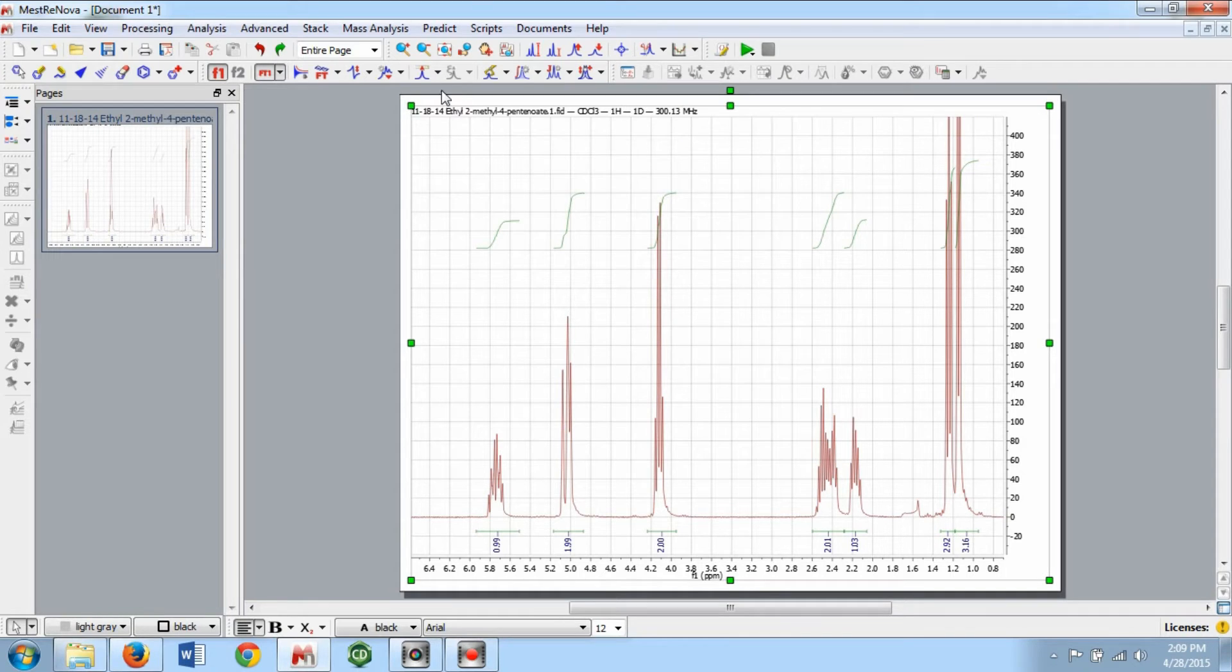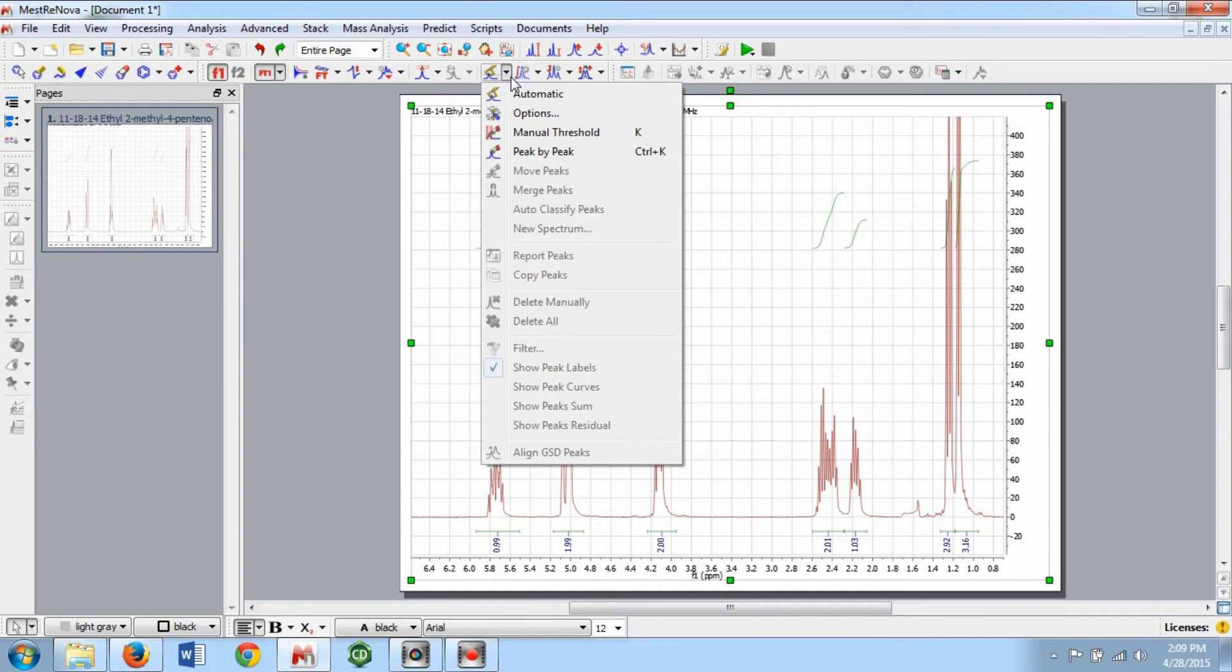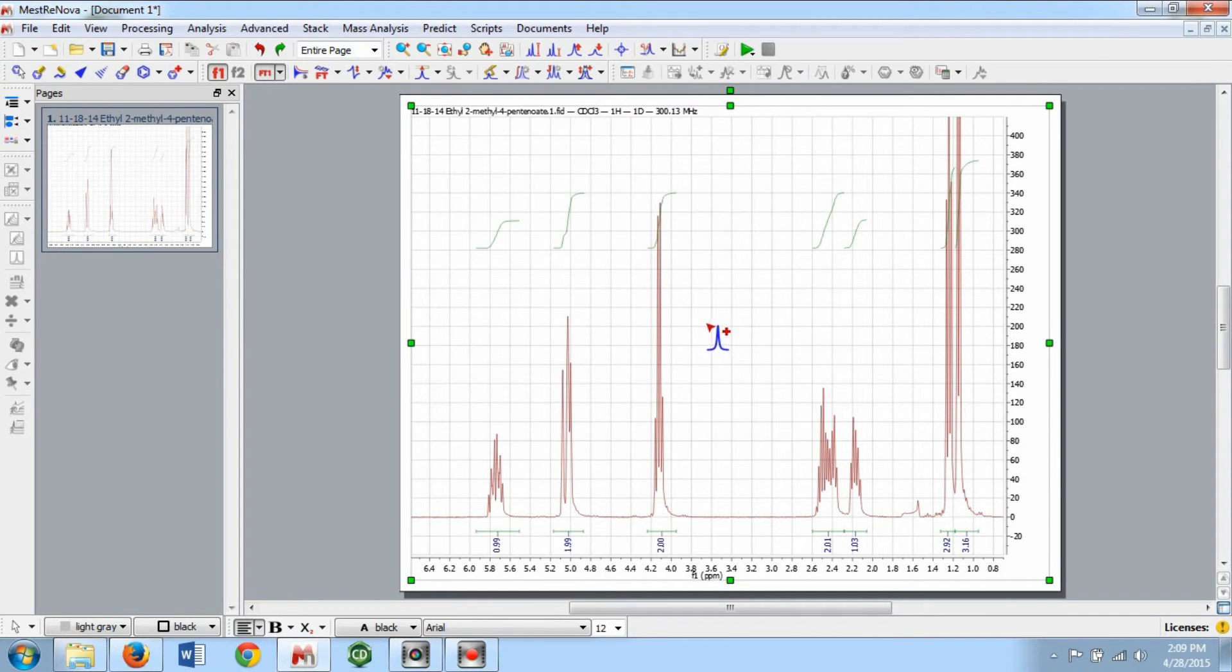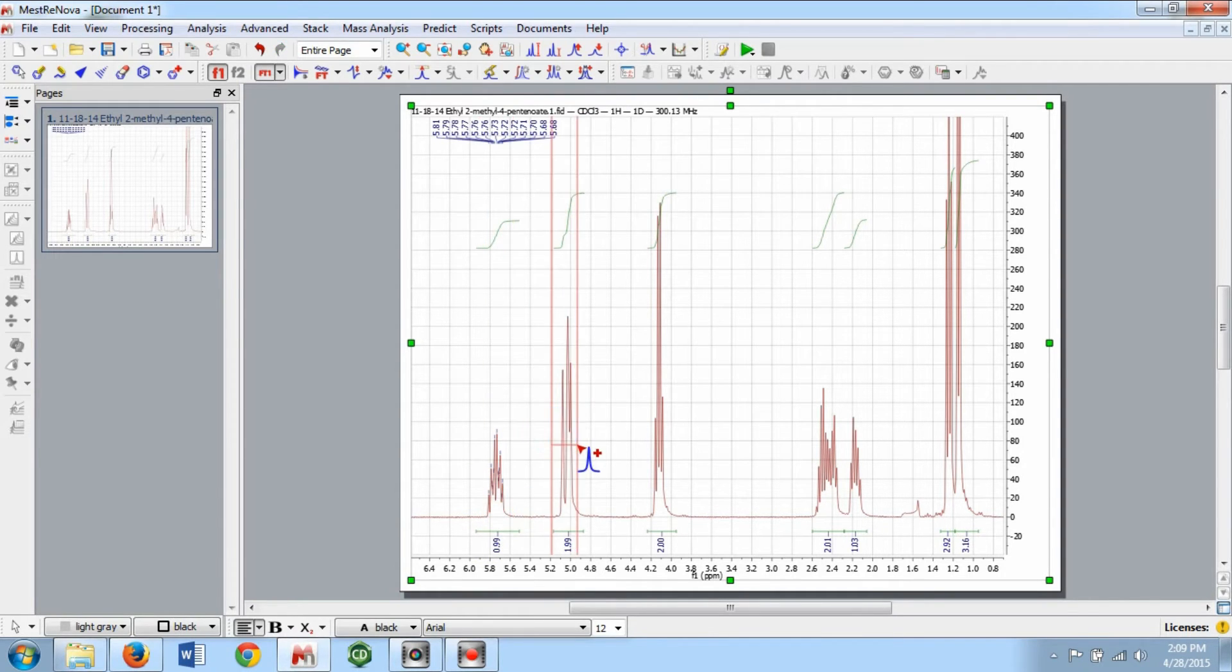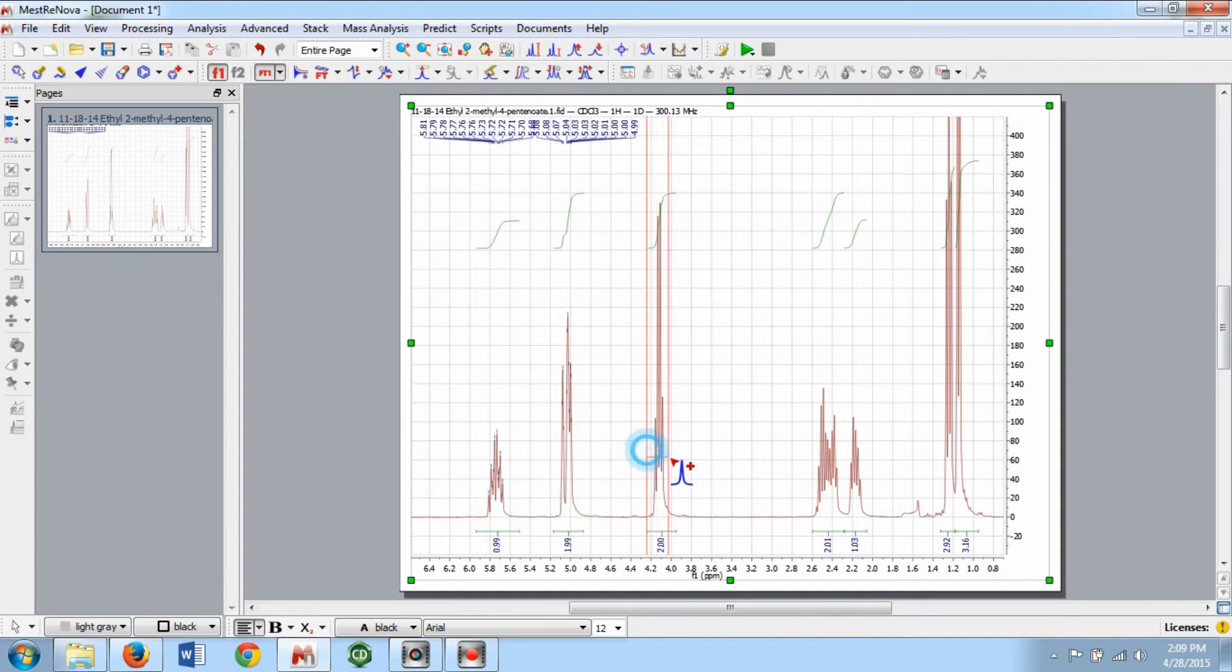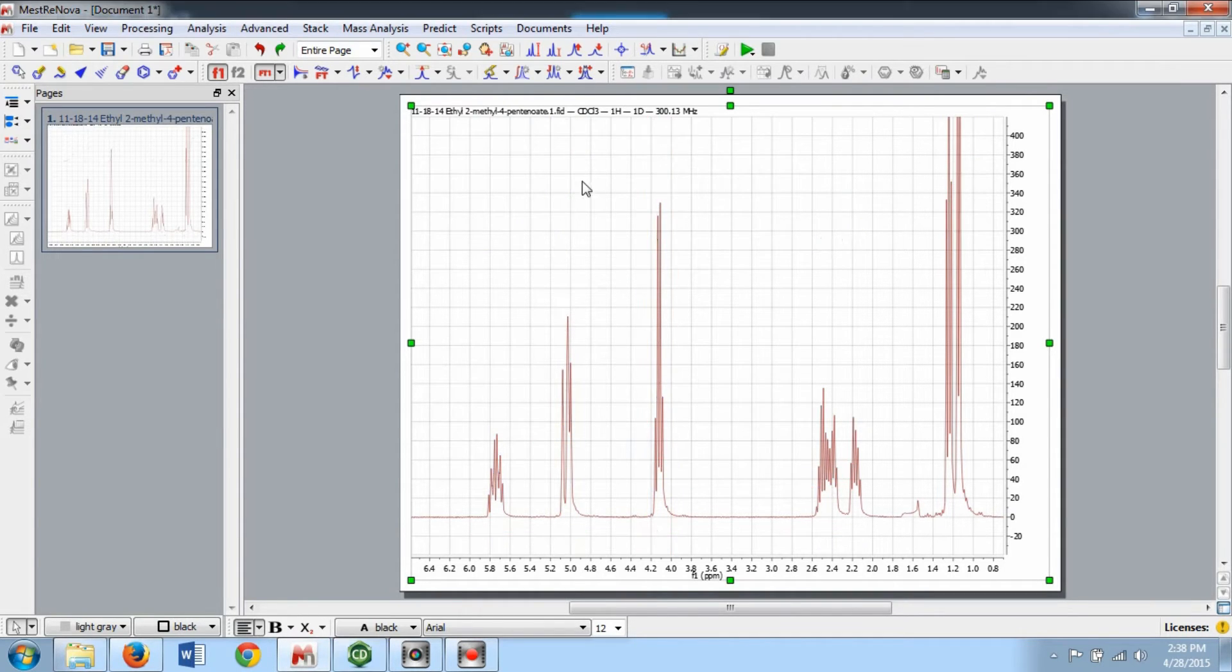A third option is to select peaks with the Manual Threshold command, which can also be accessed by hitting K on your keyboard. This will allow you to select only the peaks above the horizontal red line and in between the vertical ones.